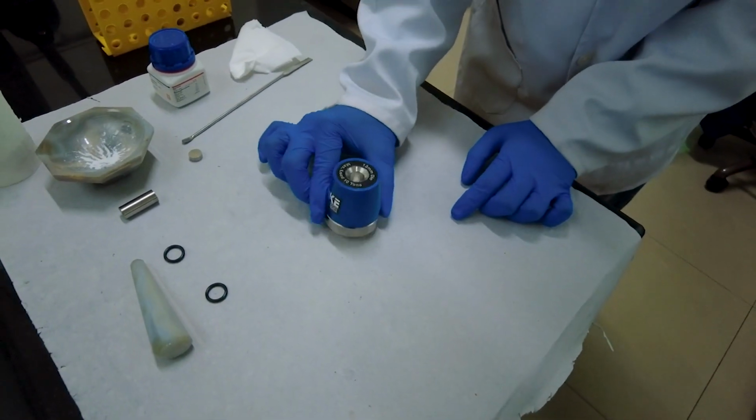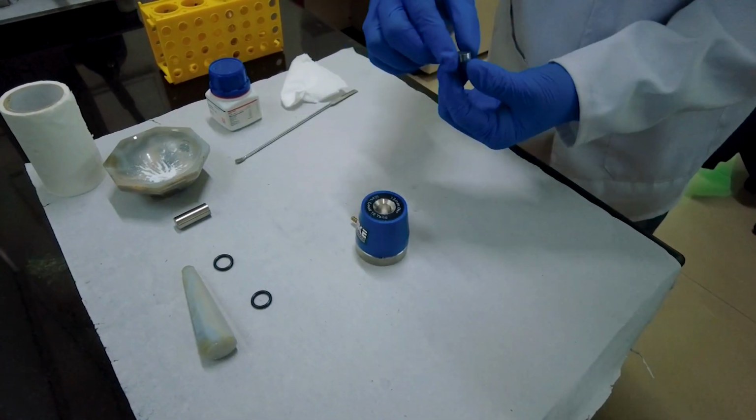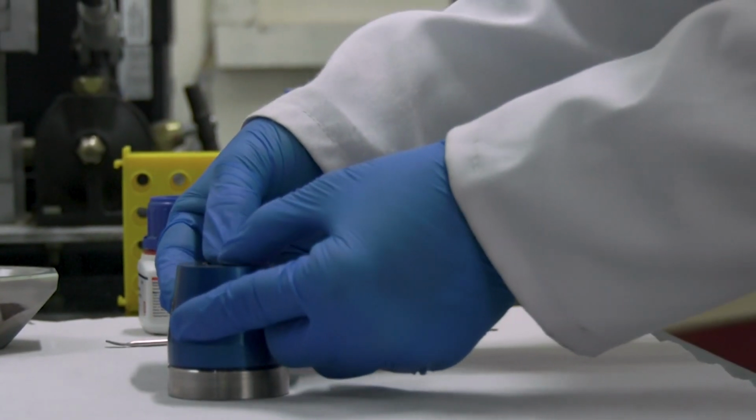Tap the assembly a few times to settle all the powder on the base of the pelletizer. Now insert the other parts of the pelletizer from the top.